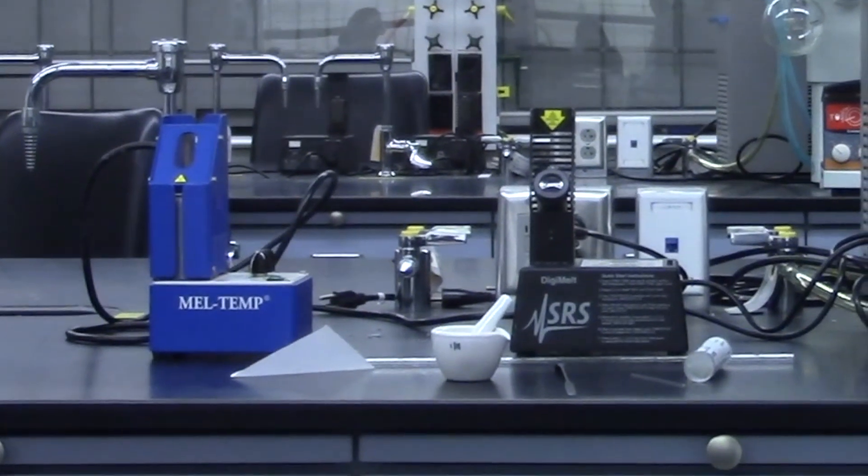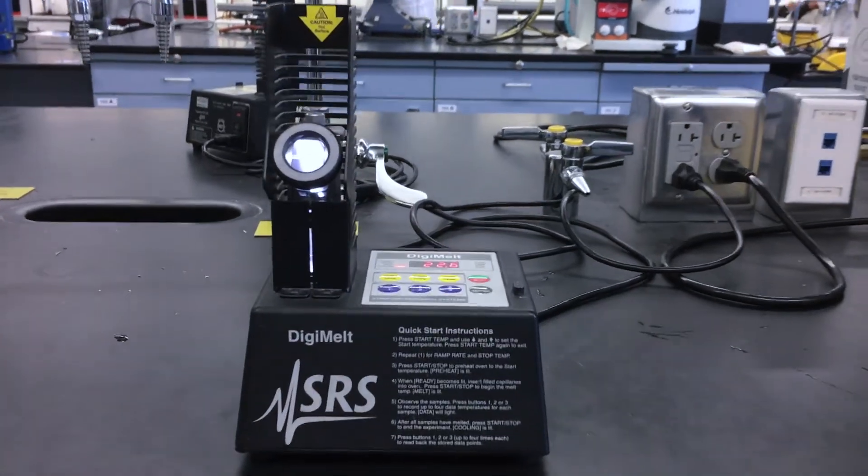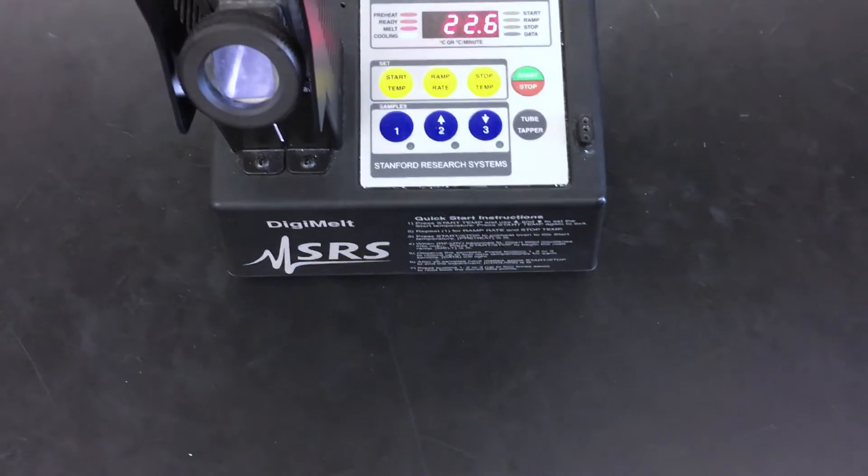There are two kinds of melting point apparatus, an analog and a digital device. The digital one has a built-in thermometer and a tube shaker to aid in loading the capillary.